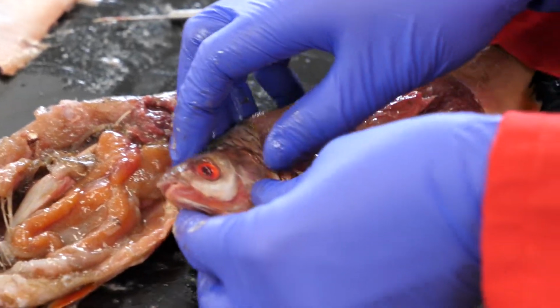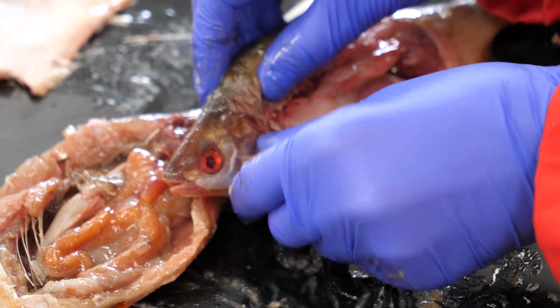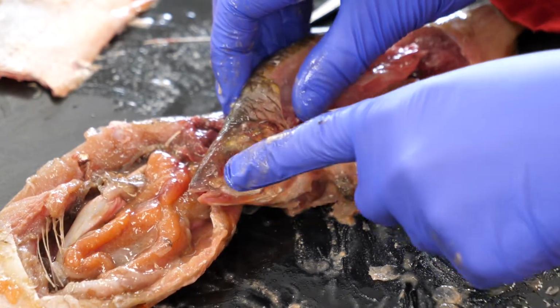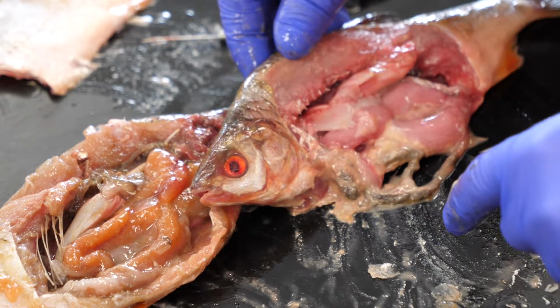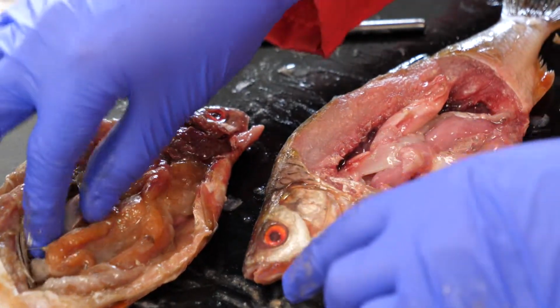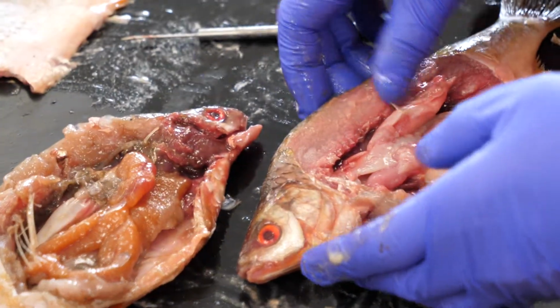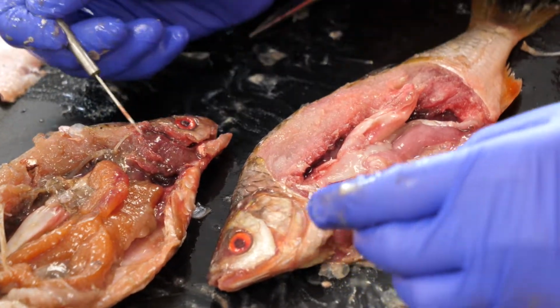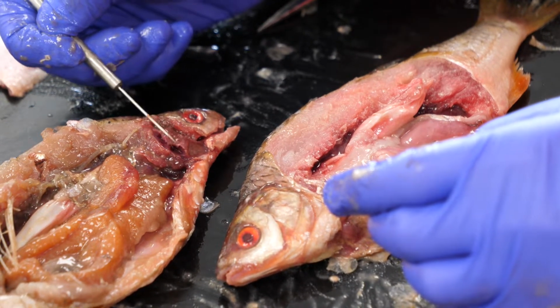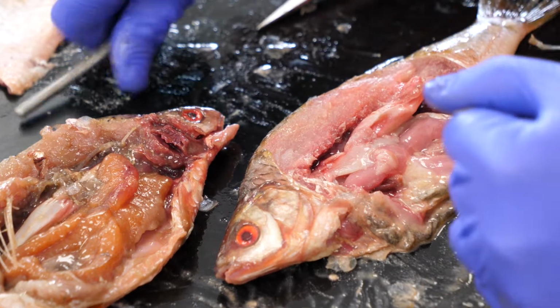One thing I did forget to point out before is that on the dorsal side of the fish, we've got the nostrils as part of the sensory organs. As I said, there will be another video which will talk you through more of the structures inside. But the most important thing with regards to the bony fish is seeing the stacking of the gill arches, one on top of the other behind the operculum here. Okay.